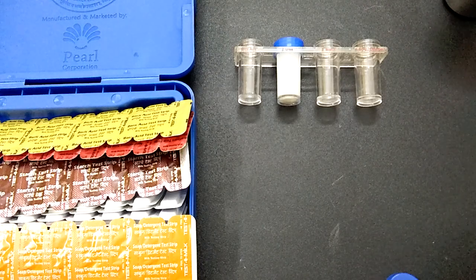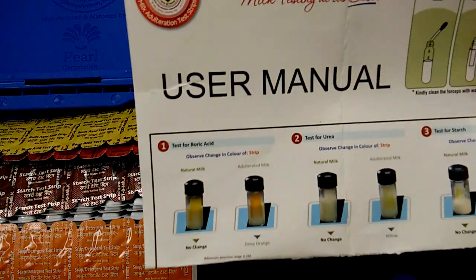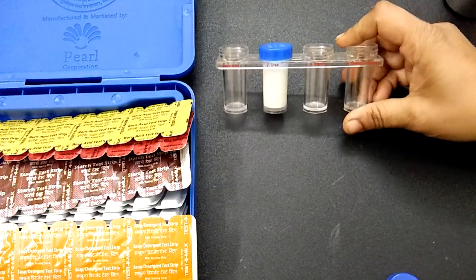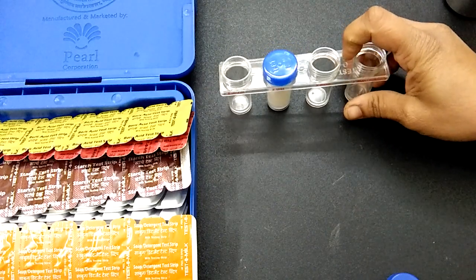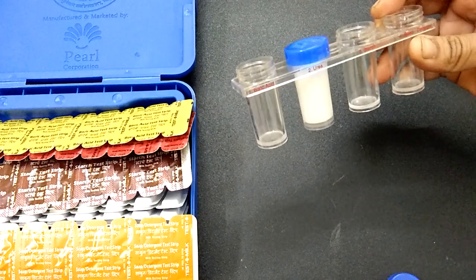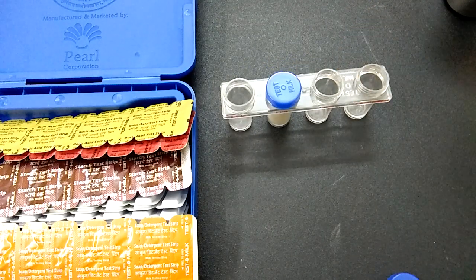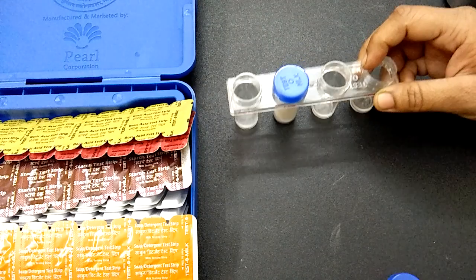This is Part 2 of testing milk with the Testo Milk kit by Dr. DVO. In the previous video, we tested for the presence of urea in milk. Now we are going to test for the remaining adulterants: presence of boric acid, starch, and detergent. Let's fill the milk into these tubes.